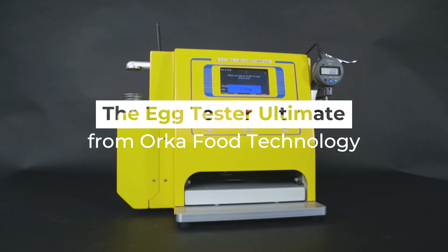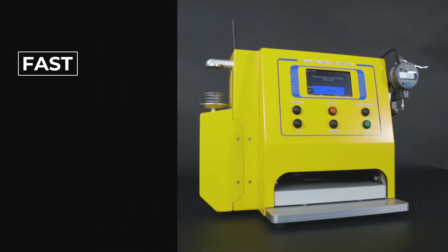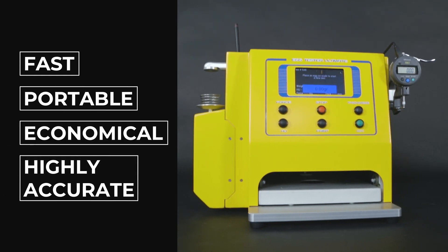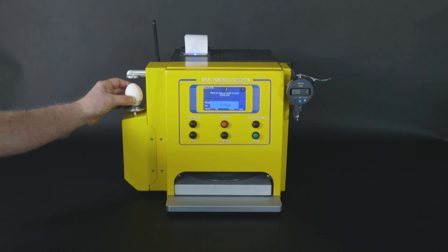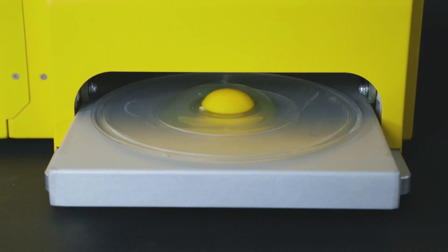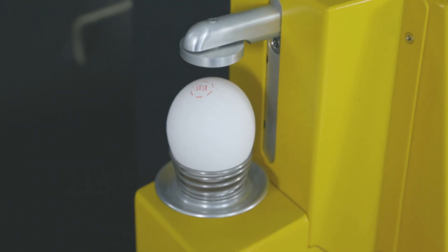The Egg Tester Ultimate from Orca Food Technology makes egg testing fast, portable, economical, and highly accurate. The Egg Tester Ultimate uses cutting-edge technology to electronically measure and calculate egg weight, albumin height, yolk color, Haugh unit, USDA grade, eggshell strength, and eggshell thickness.